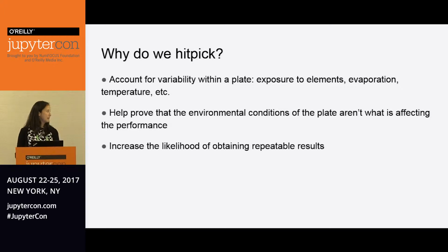So why do we hit pick? Surprisingly, despite the really controlled environments that we try to have in biology, there is still going to be a lot of variability within a plate, and that's because plates can be exposed to certain elements. There might be some evaporation going on in different parts of a plate. There might be temperature differences, and as you can see from that last plate that I showed you, a lot of times people won't even put samples in the outside wells because typically those parts of the plate might have more exposure to elements, et cetera.